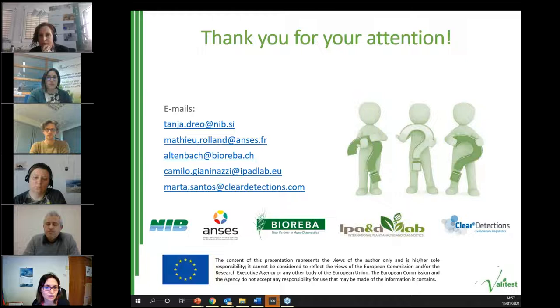So there is a question from Ruth Barnon. So I will give you the floor. You can unmute yourself and then you can ask your question. Sure. Thank you very much. I have a general question to whomever wants to answer it from the panel. It's on validation itself. In the past, or in some other bodies, they do have the term trueness as a characteristic in their validation methods or plan of validation. Do you consider that trueness could also be replaced by verification, or is this something completely different in your eyes?